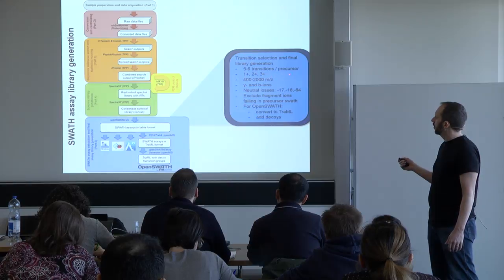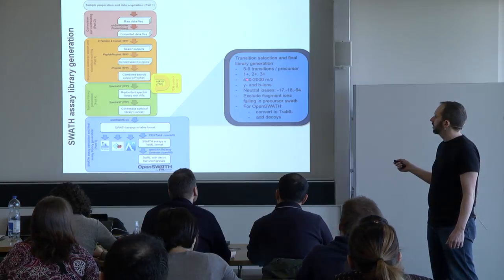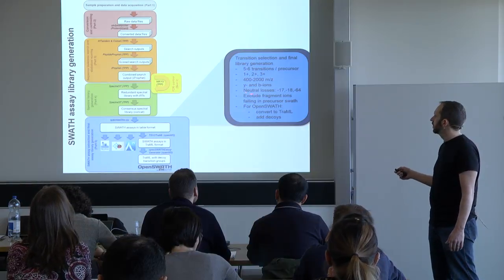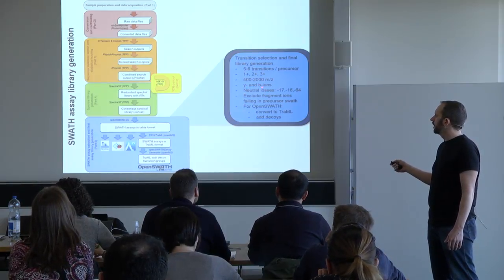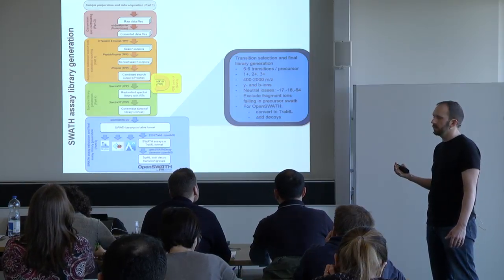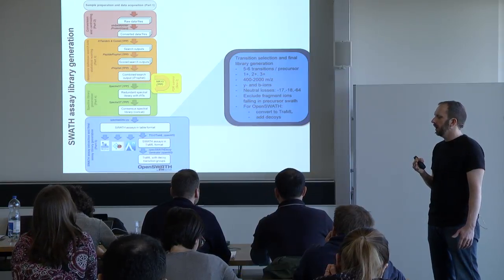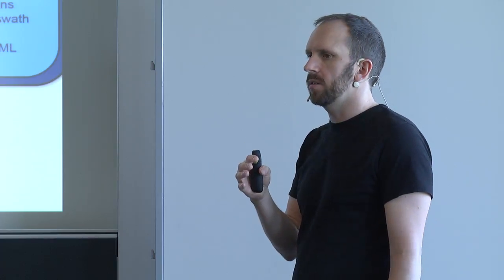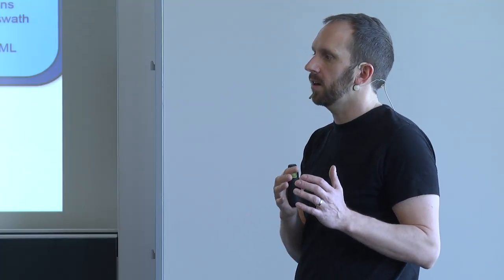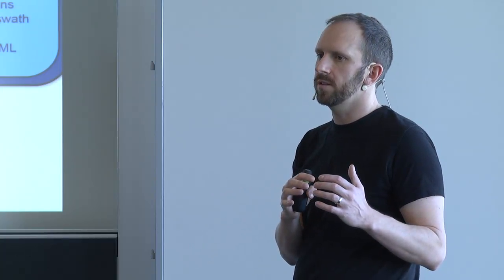We're typically taking 1, 2, or 3 charged ions. We go from 400 to 2000 m/z, because in general the lower mass range below 350 or 400 has a lot of interferences. We typically take y and b ions, at least in the case of a label-free analysis. If you have heavy peptides, then this might cause a problem, right? The b ion series won't work at all if you have peptides which are C-terminally heavy isotope labeled, because the b ions will not contain this heavy isotope, and they'll look the same in the light and heavy in a SWATH analysis if the precursor is in the same SWATH window.